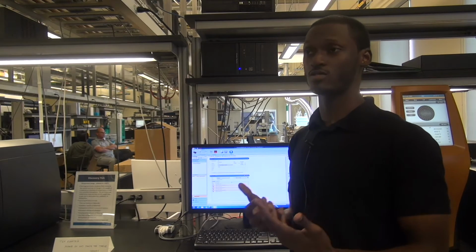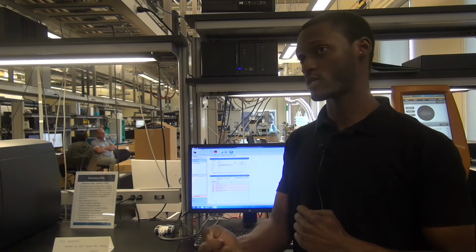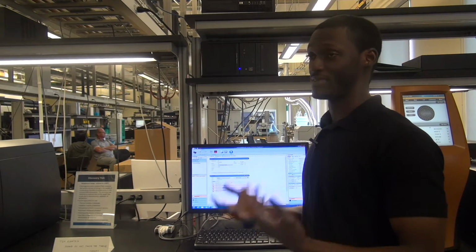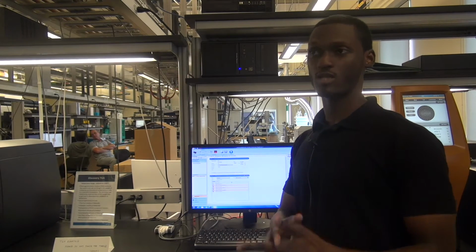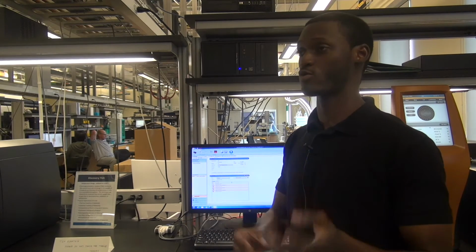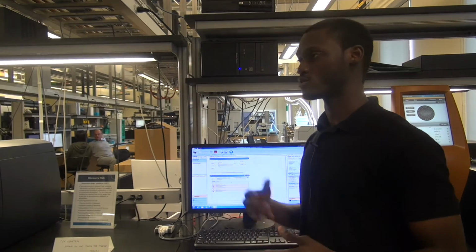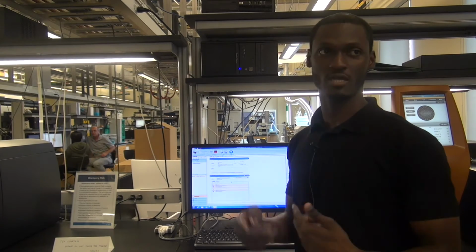Now, of course, sometimes you may want to do that for certain reasons. For example, I may want to cool my sample really, really quickly because I don't want it to crystallize. That means I'm basically quenching my sample completely. That's possible with certain samples. So in that way, changing my cooling rate can change what I see in my subsequent heating, because now I've quenched it completely and there's no crystals in there. So it's going to look completely different than if I cooled it at 5C per minute and I actually allowed it to crystallize itself. So it'll be 2 completely different experiments, or 2 different sets of data that you'll obtain by just changing that cooling rate.